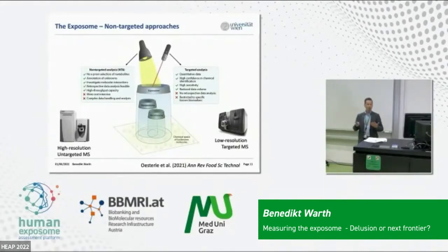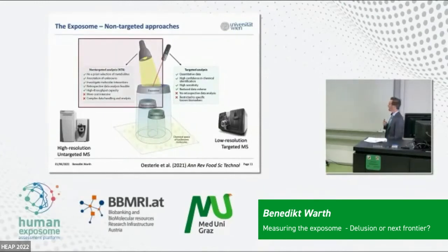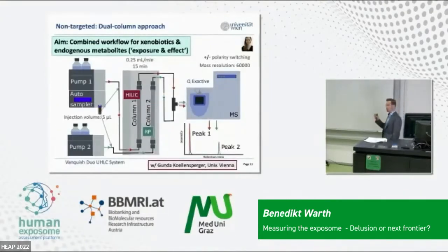It's still beyond state of the art, but I think the real future will be the non-targeted analysis, where we're going to high resolution measurements and can also look for emerging contaminants that we maybe don't even know today. So here I want to present you one workflow that was developed by Mira Flash over the last 4 years. So it was quite an intense PhD work.